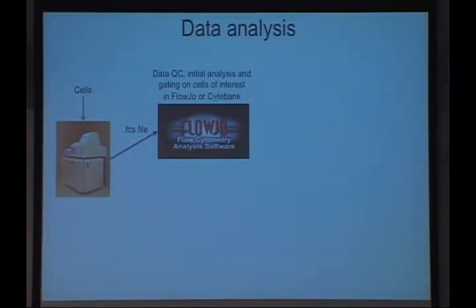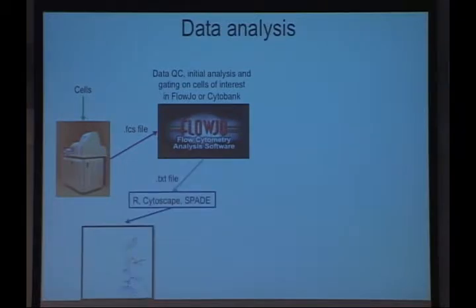You could just as easily do this in Cytobank. What's nice about Cytobank, as you heard, is that they're incorporating these new ways of looking at data as well. I just happen to be a little bit more familiar with FlowJo at the moment. And then, as Aaron went over, the SPADE approach is also being incorporated into Cytobank.